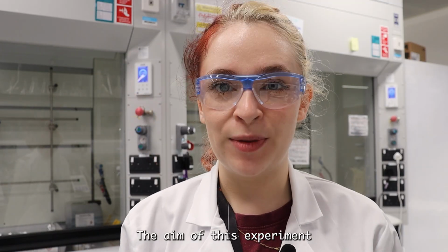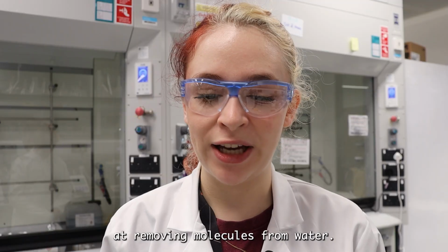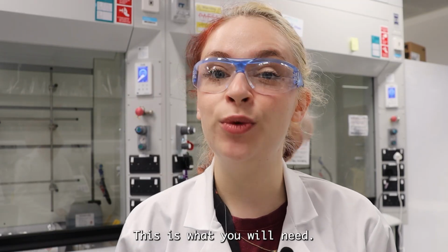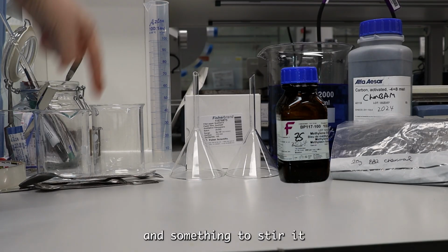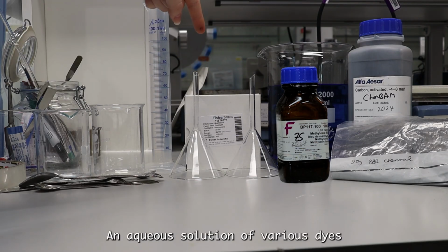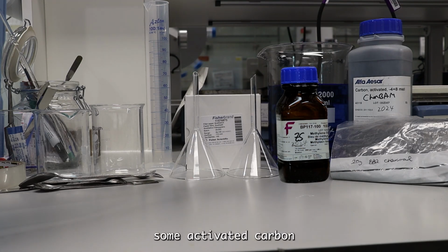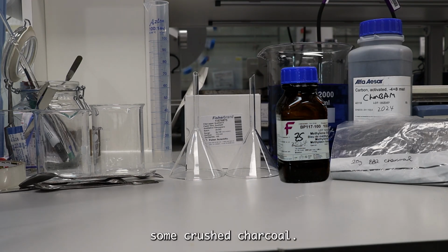The aim of this experiment is to see whether activated carbon or charcoal is better at removing molecules from water. This is what you will need. Some glass beakers and something to stir it with, a measuring cylinder, some filter paper and funnels, an aqueous solution of various dyes or food colourings. Here I'm using methylene blue solution, some activated carbon and some crushed charcoal.